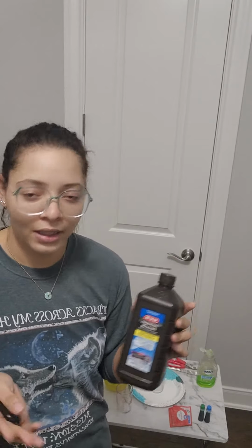With this elephant toothpaste experiment today, we will be using hydrogen peroxide. I know it says to use 10% hydrogen peroxide, and that is to get a more exothermic reaction. What I could actually get a hold of in a reasonable time frame was just household 3% hydrogen peroxide, so hopefully the reaction still works. It just might not be as exothermic or as large of a reaction as if I had used 10% hydrogen peroxide, which is fine as long as we still get the same concept.